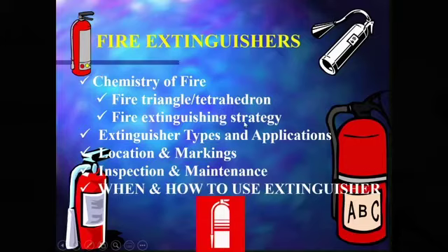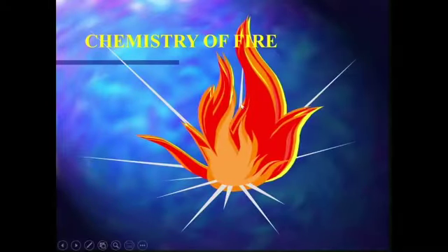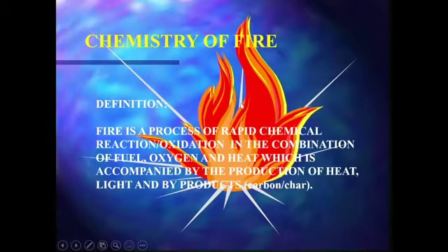Hope everybody is doing fine this morning, because we need to extinguish the fire. Pay close attention. Okay guys, let us talk about the chemistry of fire. Basically, a fire will only start, okay? By definition, a fire is a process of rapid chemical reaction, oxidation, in the combination of fuel, oxygen, and heat, which is accompanied by the production of heat, light, and byproducts.